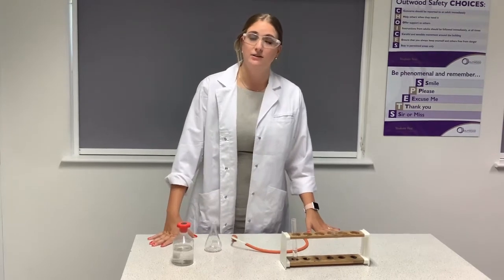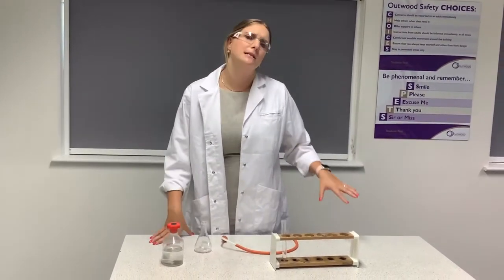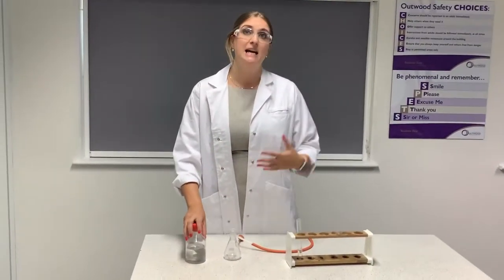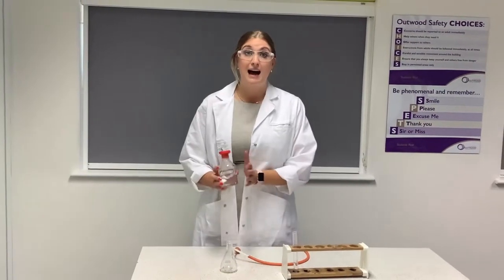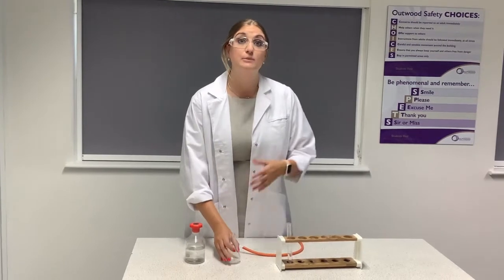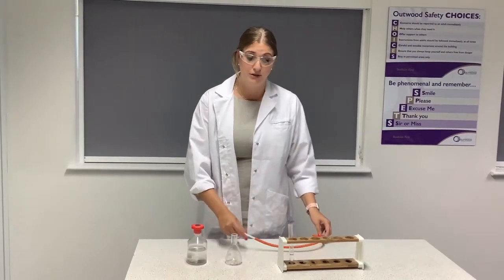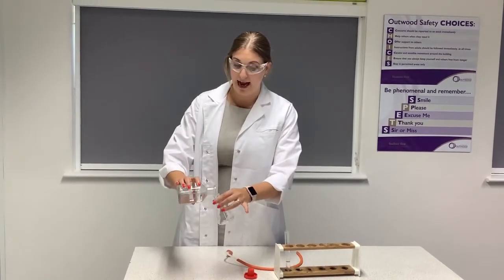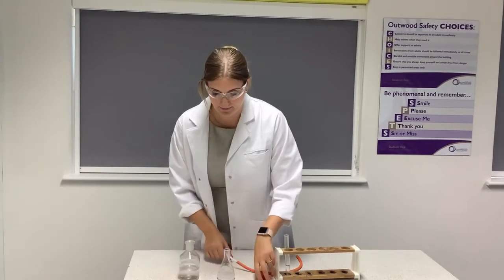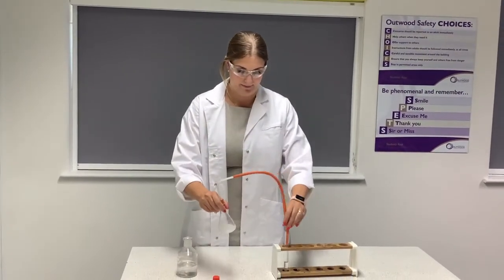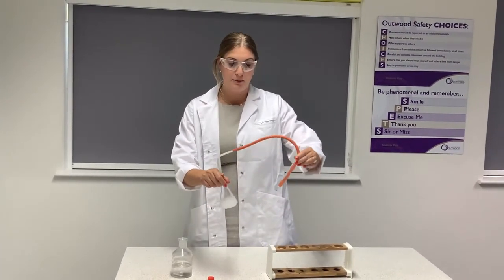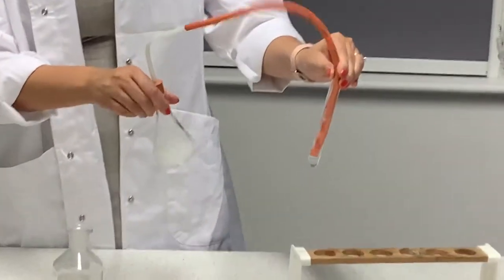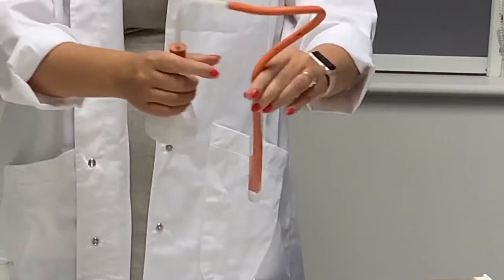We're going to test for carbonate ions now. In this test we do it slightly differently, because we end up testing for the gas evolved when carbonates react with acid. We add acid to our sample containing carbonate ions, which produces carbon dioxide gas. If we bubble that gas through limewater it should turn cloudy. I'll just add my acid and as it's bubbling through we should start to see the limewater sample turning cloudy — and that is the positive test for carbonate ions.